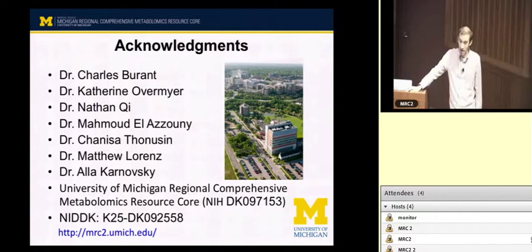Dry is usually better than in solvent. So if we know we are going to want to go back to samples later, we may dry down and then put them in the freezer and leave them sitting there. Again, things that are sensitive to oxidation in the air may be unstable even under those conditions. But generally dry is better than in solvent. Cold is better than warm. Surprise, surprise. Yeah. One last question.